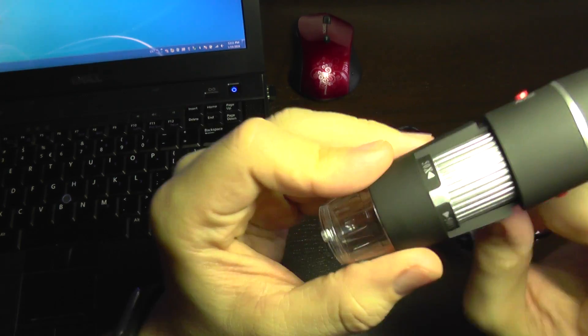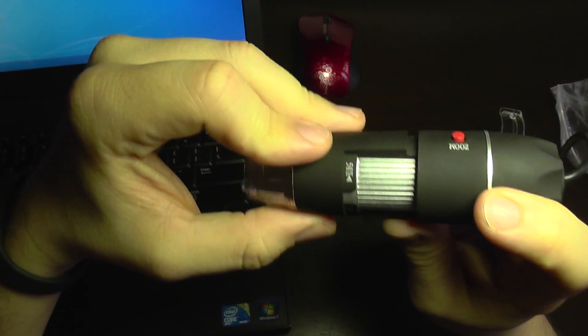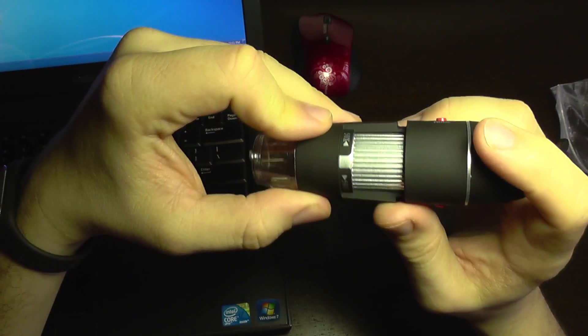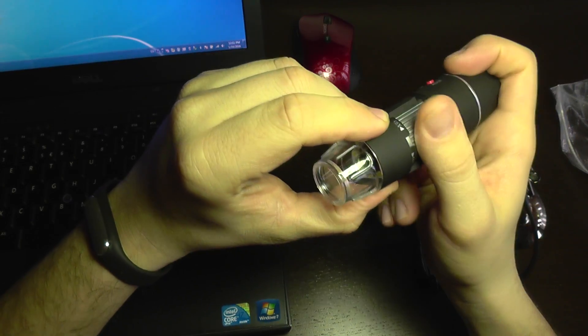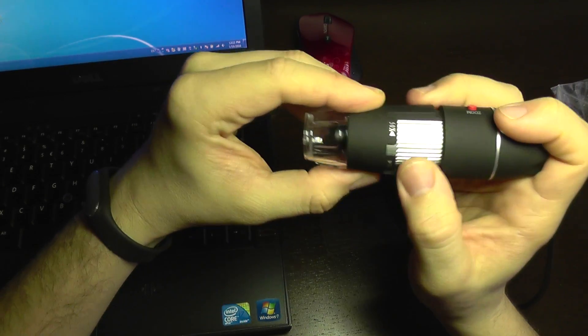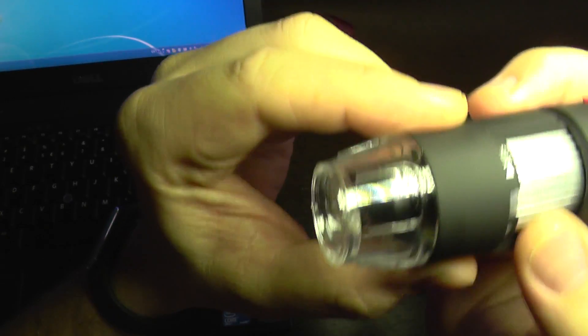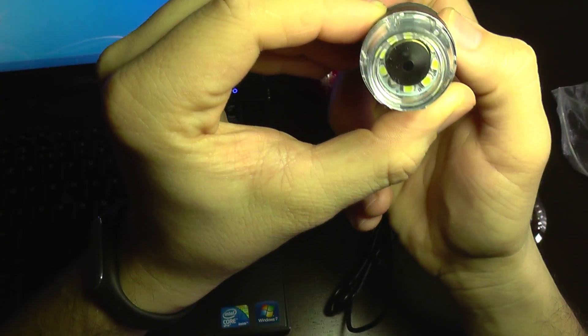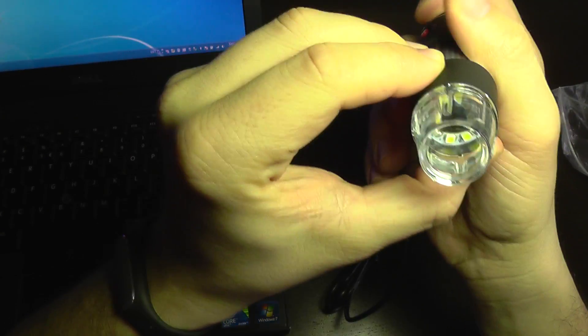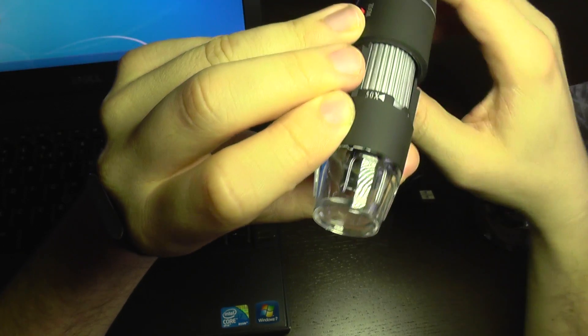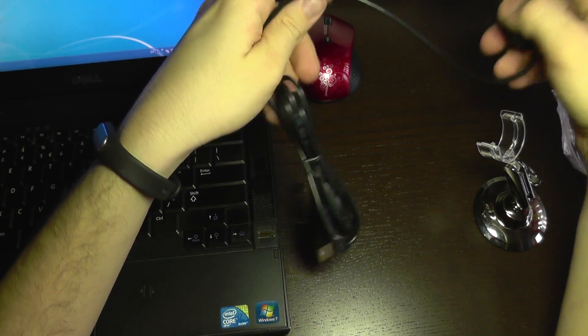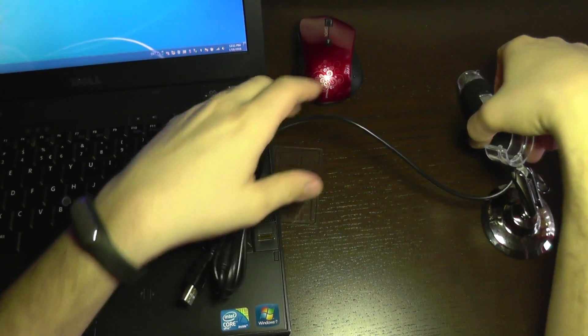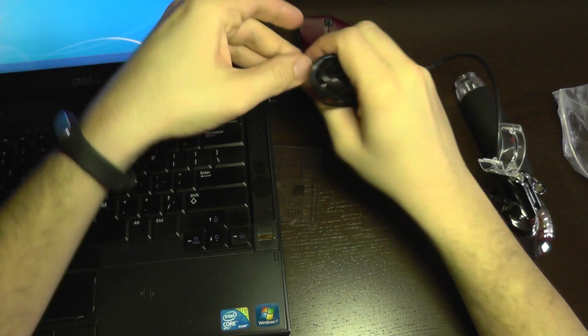It has a magnification from 50 times to 500 times. Here you can see the lens moving inside. It also has some LED lights. Let's see if we plug it in what happens.